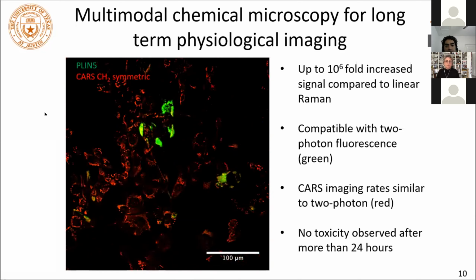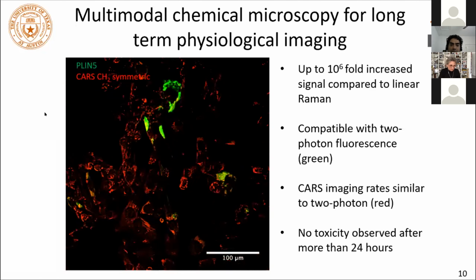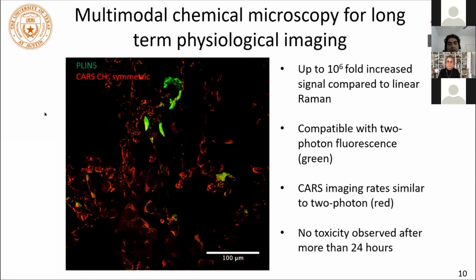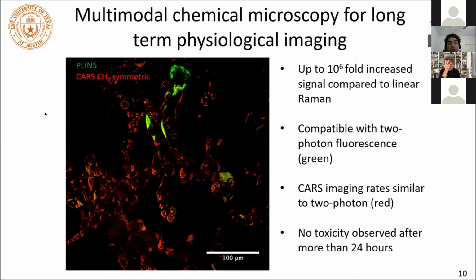And so you have a lot of flexibility and a lot of abilities that this affords you, because now you can see things without labels if you're interested in them, which I am, and the reason I'll explain shortly. You can also do this for a long time and have optical resolution. You have all these combinations at once, but you don't need a long waiting time to get the information you want.